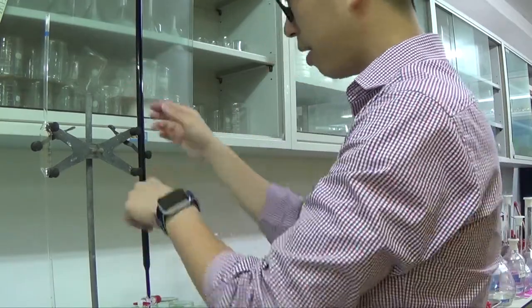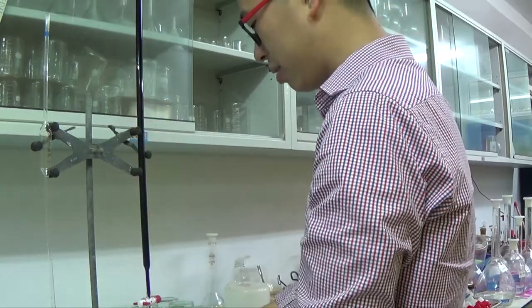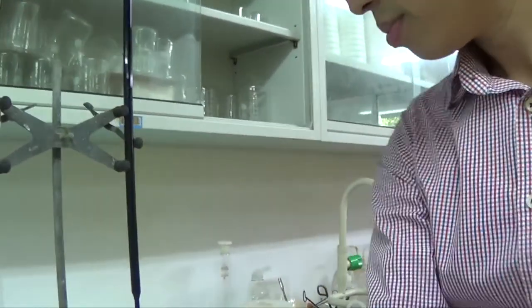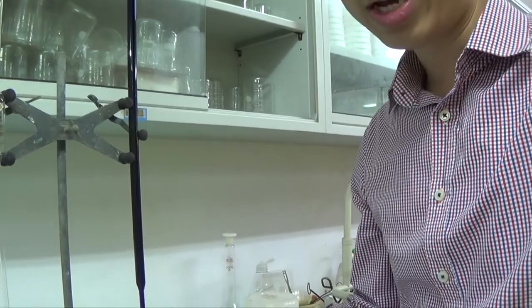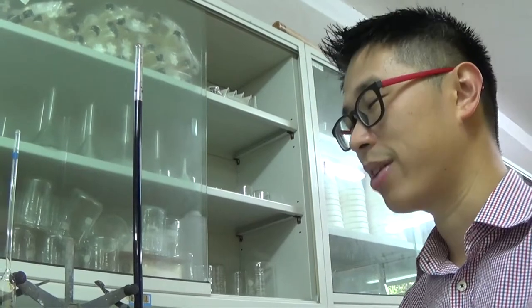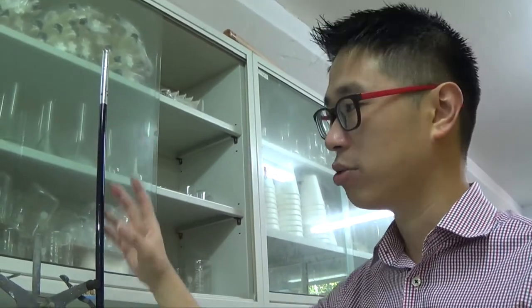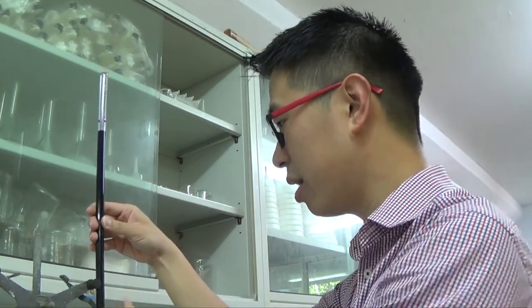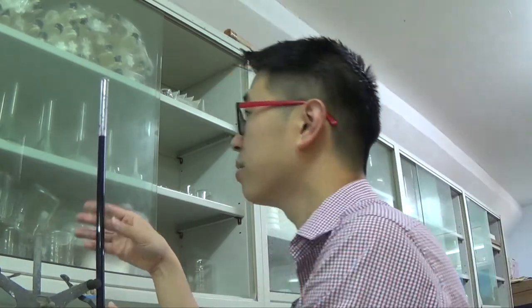So I have 25 cm3 of the iron 2. I don't really want to be super exact for my rough titration. I could just do this to find out roughly how much I need, right? So before that, I should really read the volume first.